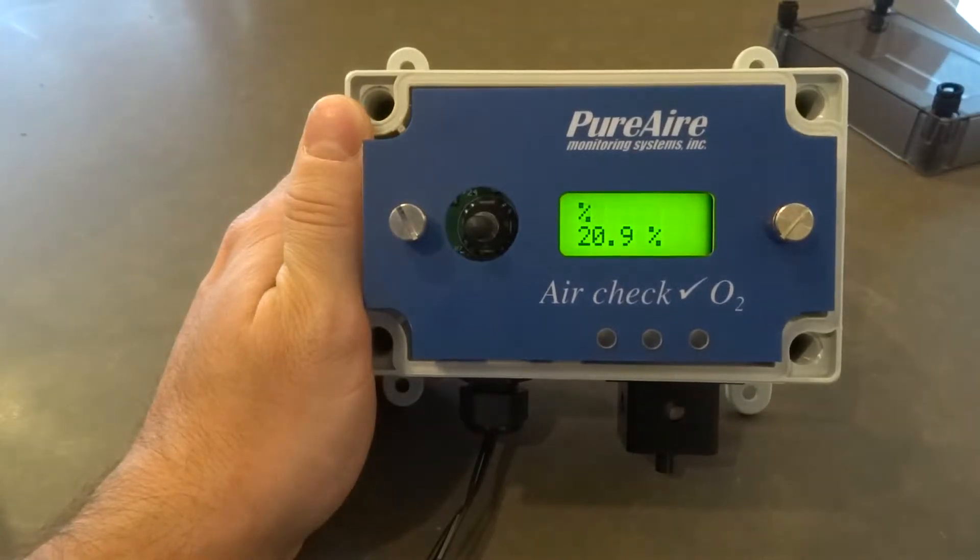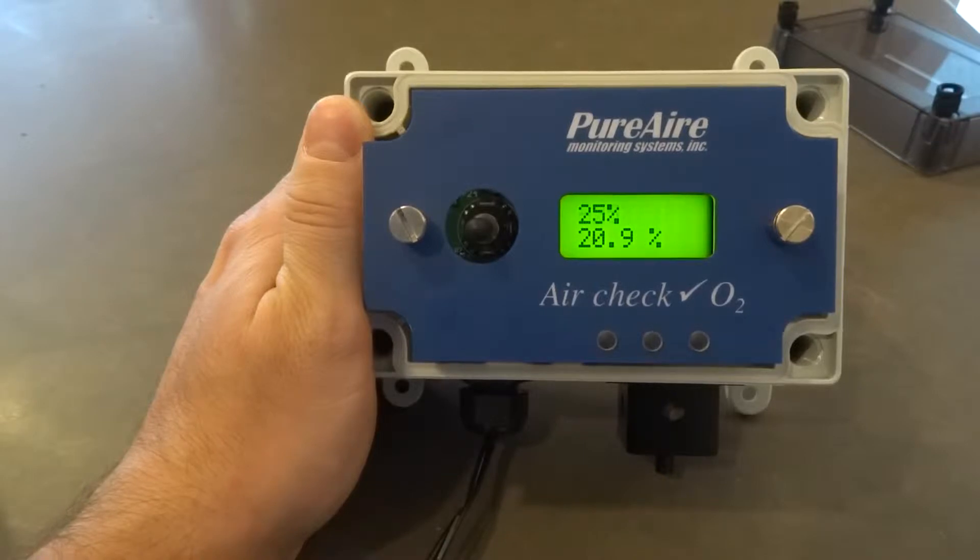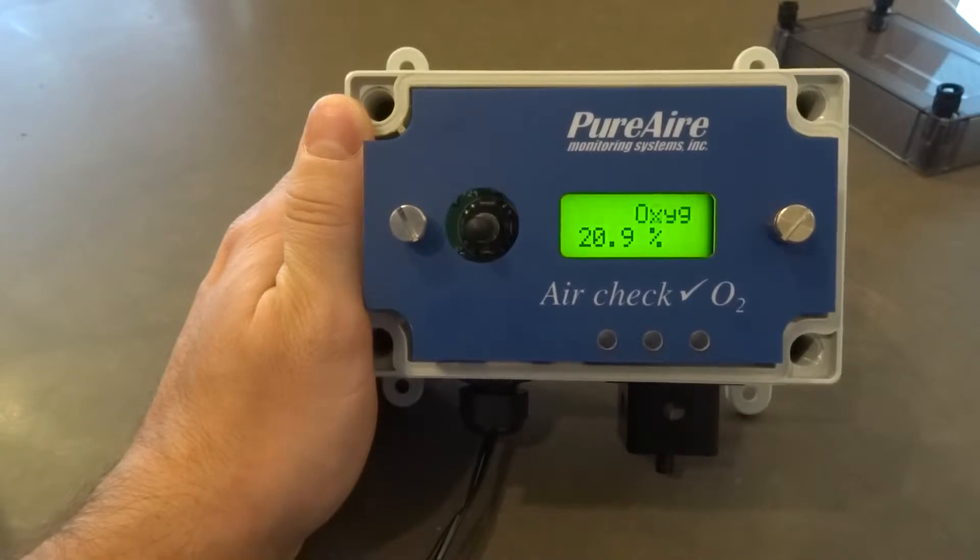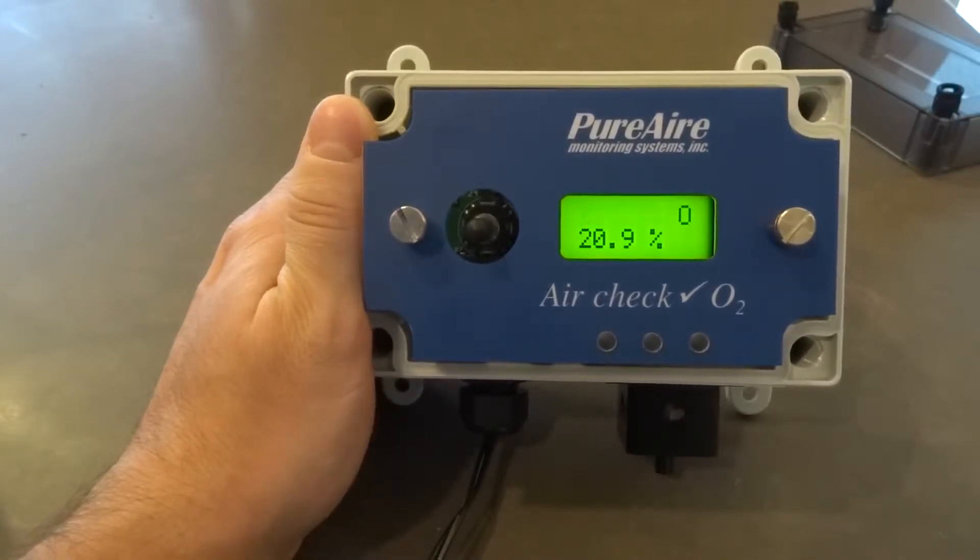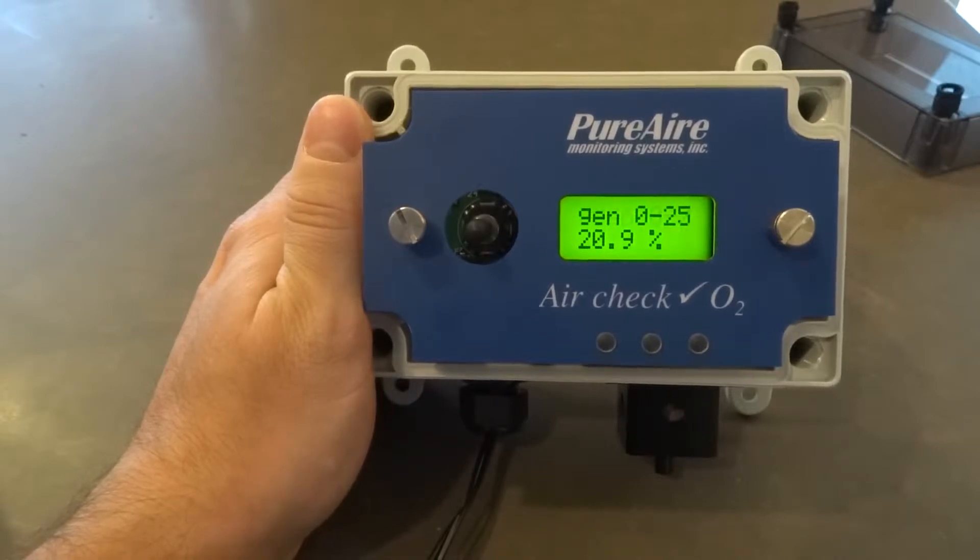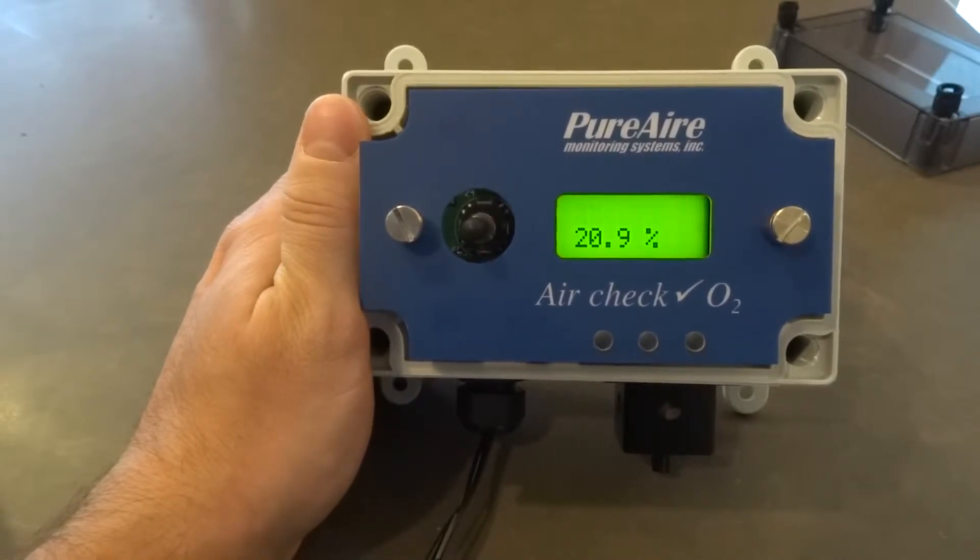In the last tutorial I showed you how to maneuver through the menus using the joystick function. In this tutorial I'd like to subject the sensor to some gas so we can trigger some alarms and you can see what happens.